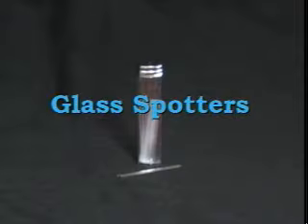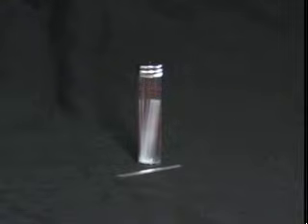A sample is applied to a TLC plate using a thin glass spotter. Micropipettes, such as the ones shown here, can be used and are conveniently commercially available. However, in many laboratories, TLC spotters are prepared by heating and pulling capillary tubes or disposable pasteur pipettes. One benefit of making your own spotters is that these homemade spotters are usually thinner than commercially available micropipettes. You can watch the advanced thin layer chromatography video for a demonstration of this procedure.